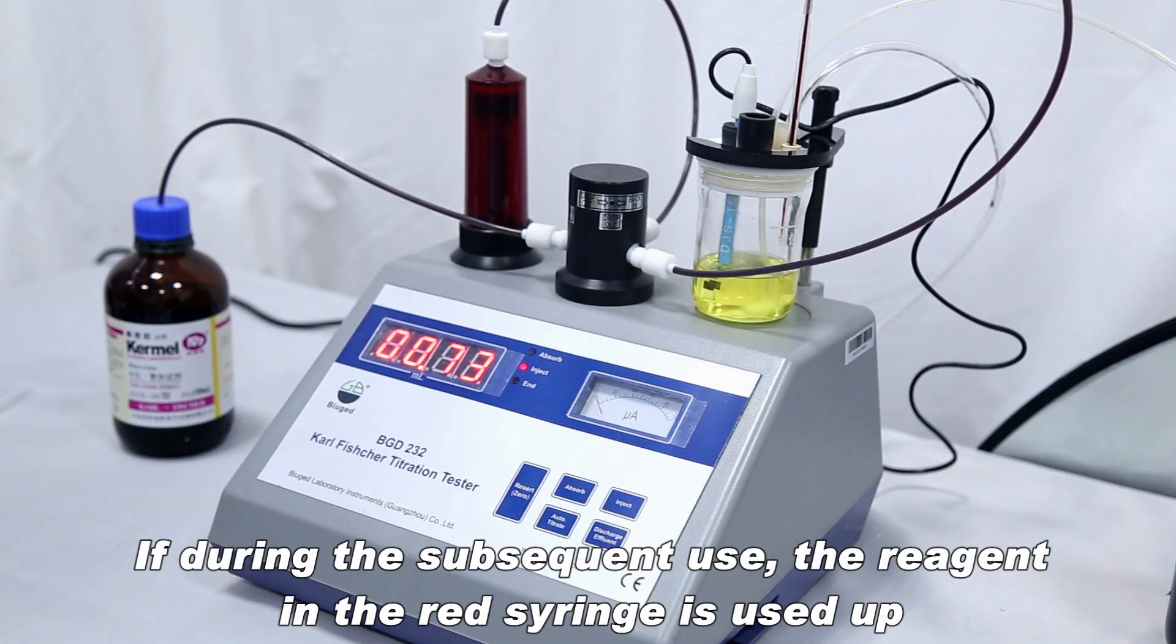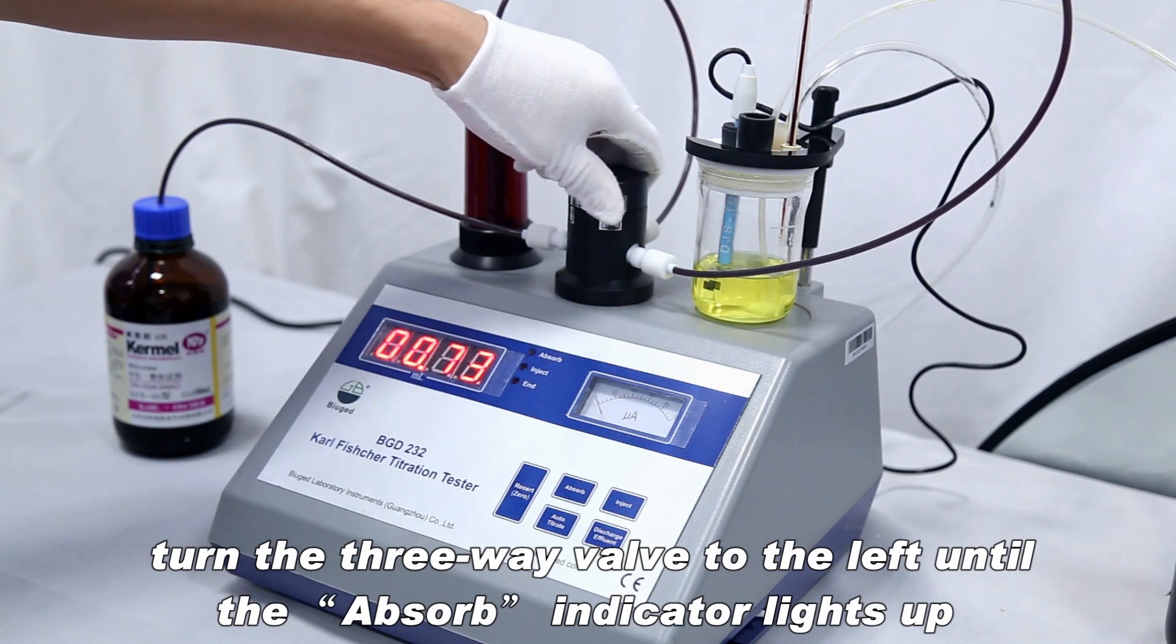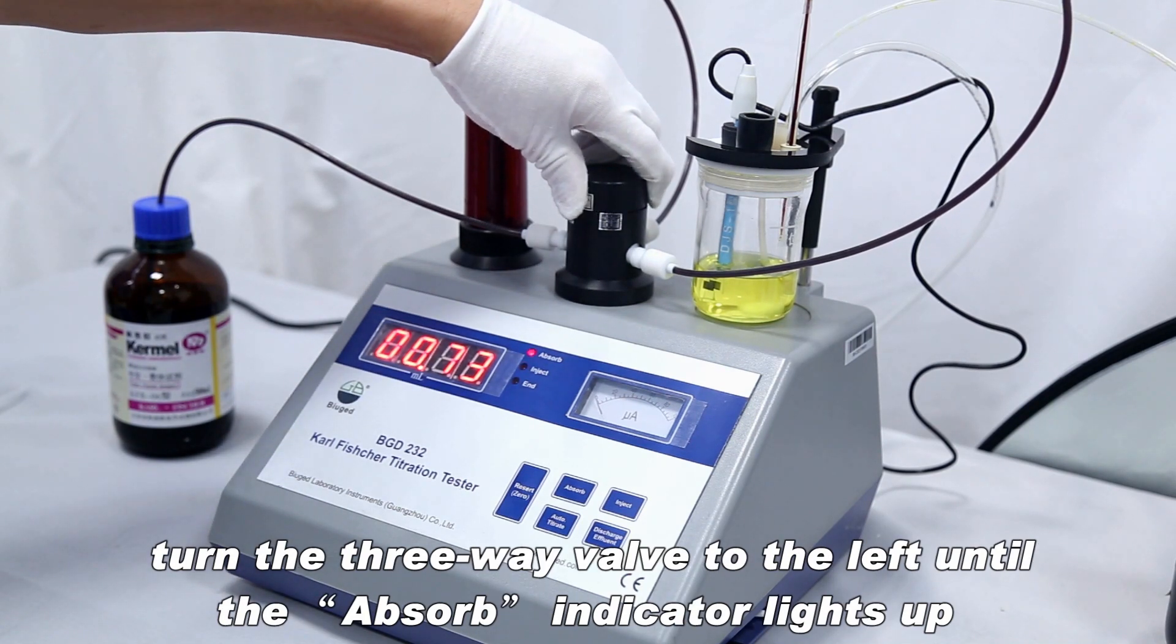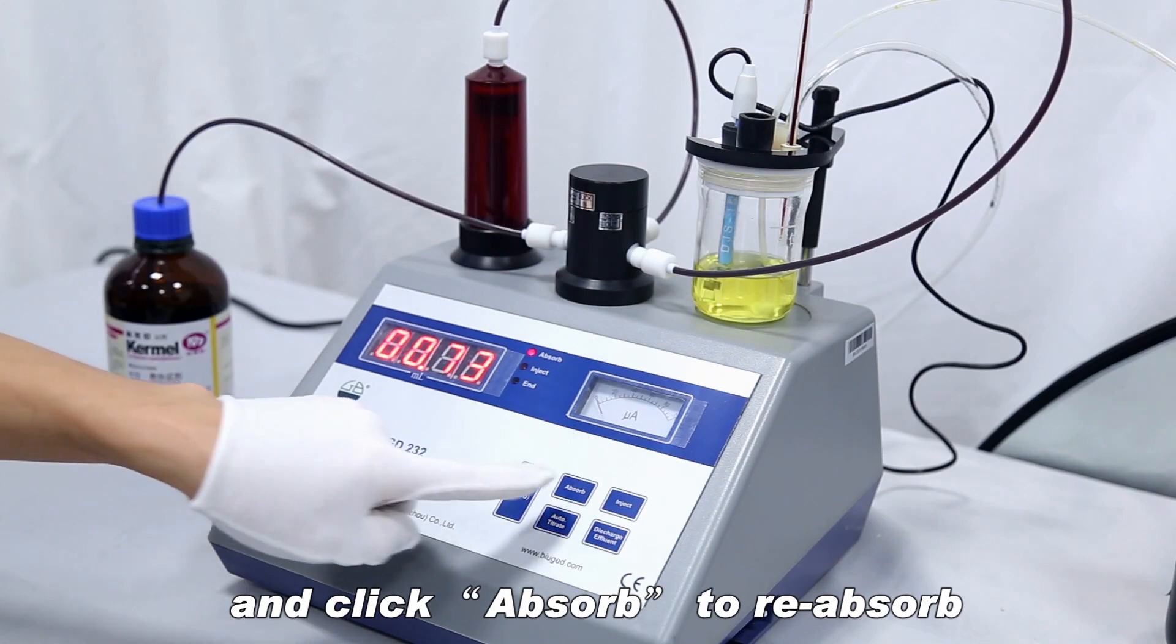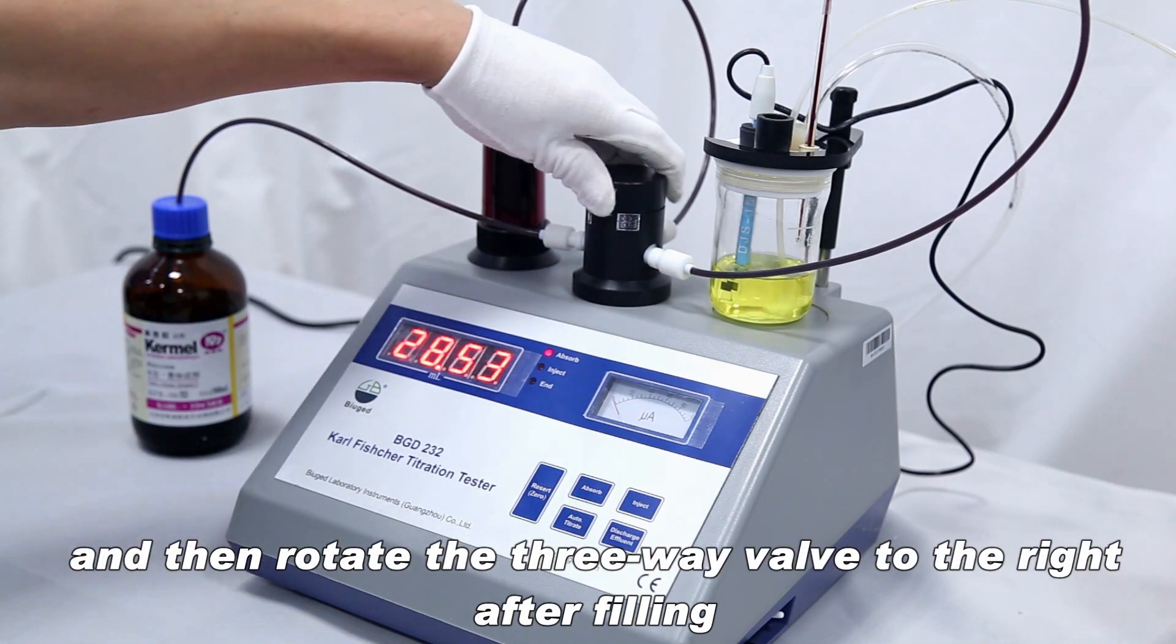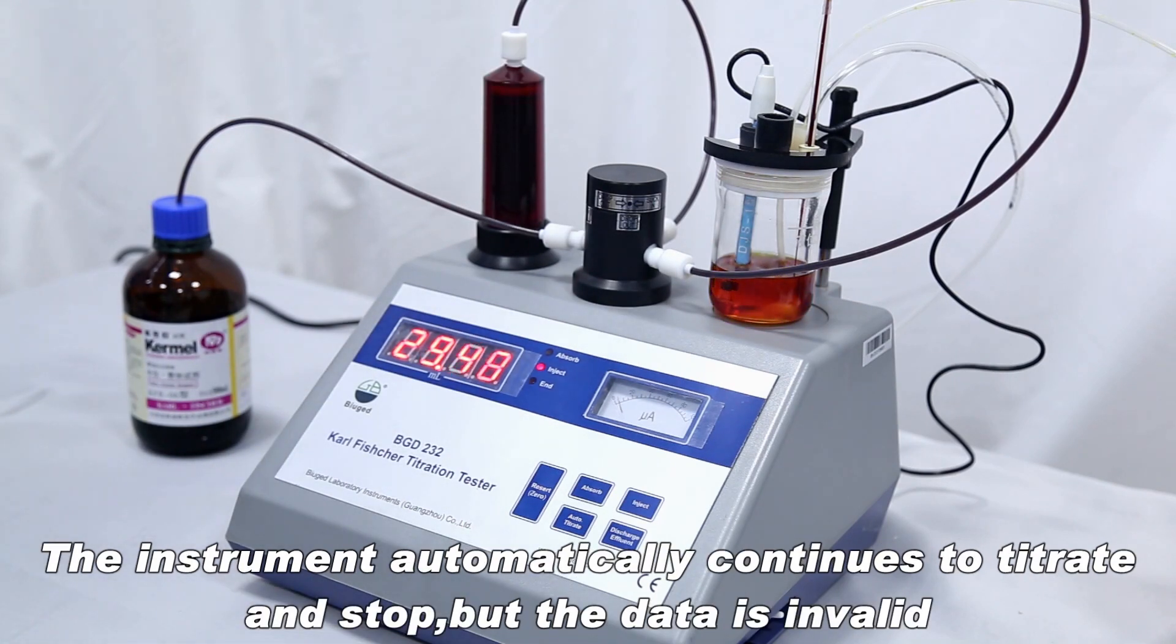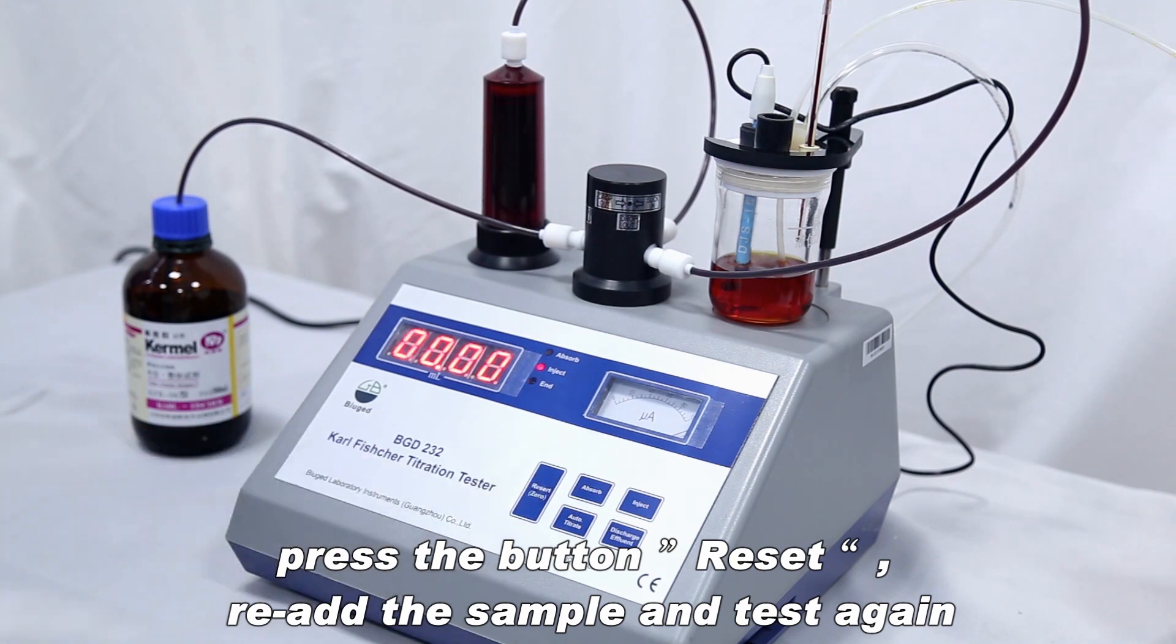If during the subsequent use the reagent in the red syringe is used up, turn the 3-way valve to the left until the absorb indicator lights up and click absorb to reabsorb. And then rotate the 3-way valve to the right after filling. The instrument automatically continues to titrate and stop but the data is invalid. Press the button reset, re-add the sample and test again.